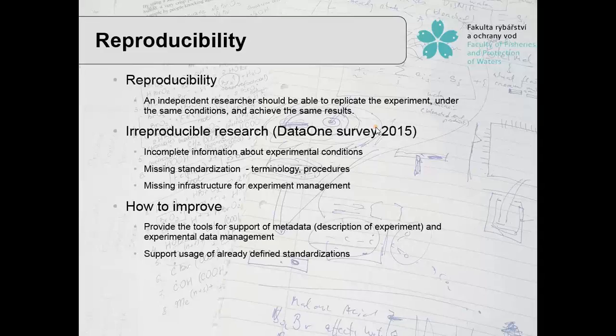As you can see, there were different issues with standardization, terminology, procedures, and so on. So we tried to support all these things in the system. And during the training course, you will see how you can use the standardizations and communicate with the measurement devices.